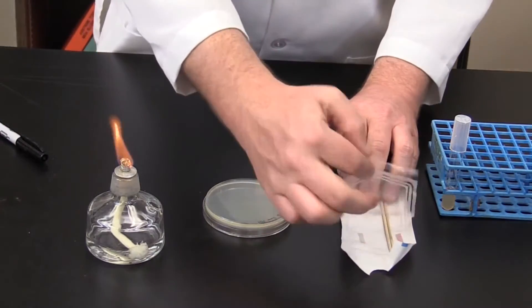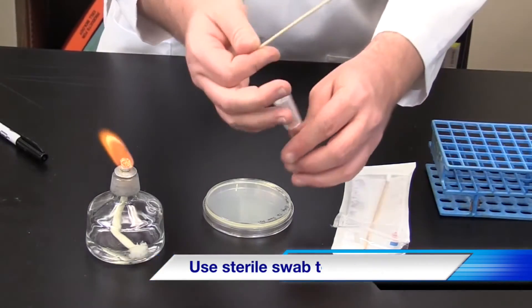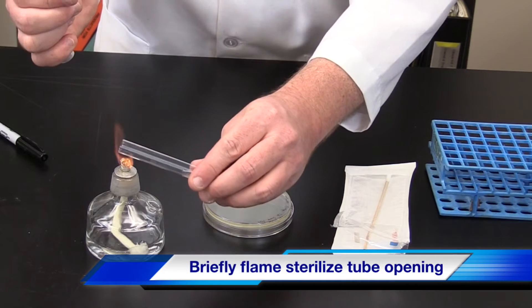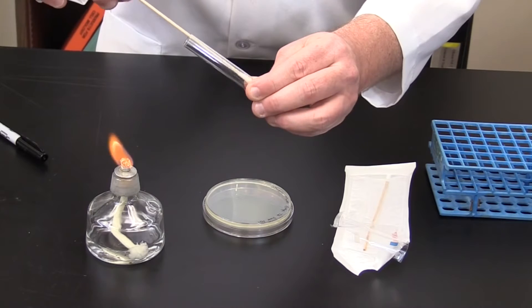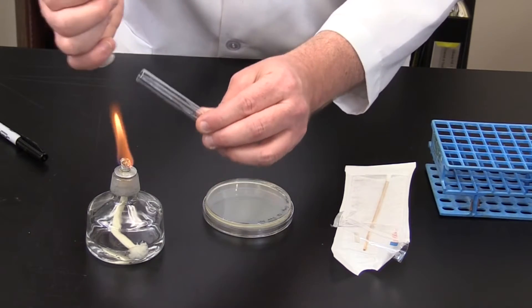Next, we're going to use a sterile swab to inoculate the plate. Grab the test tube and remove the cap and gently flame sterilize. Dip the swab into the bacterial broth. Remove from the tube and gently flame sterilize. Recap the tube.